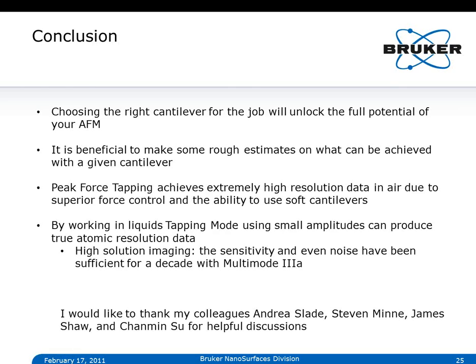Try to avoid static electricity on samples if you can. That will also have an effect on how much your tip can pick up. Try to use a little alpha source that you can buy in a photo supply store. You can buy these little brushes, which when you open them up have a little polonium source in them. Just stick it next to your sample to avoid static electricity. But can you clean particles off your tip? In my experience, you cannot.